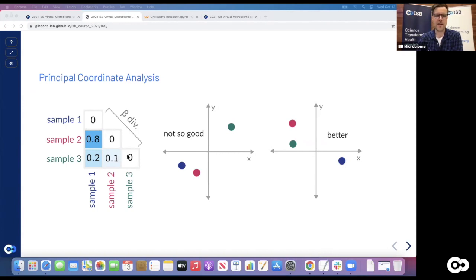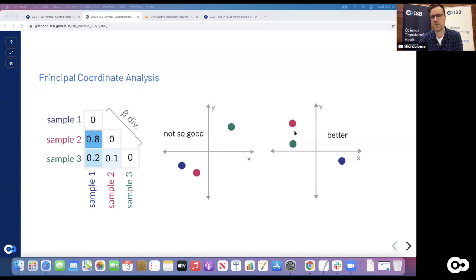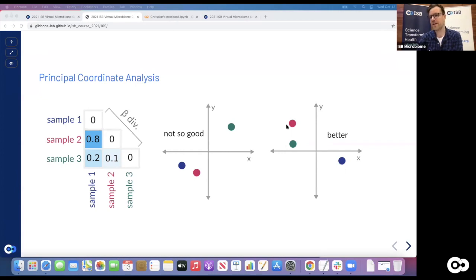A principal coordinate analysis is kind of the best linear projection of the distance matrix - it means if we apply only linear transformations to that distance matrix, this ends up being the best possible method to do so. One thing that's obvious is that sometimes it's not perfectly possible to do so in low-dimensional space. For instance, if you have hundreds of samples, you can get inconsistency where it's hard to arrange them. If sample two must be really far away from sample one, but sample three has to be close to both of them, that's kind of impossible on a 2D plot.